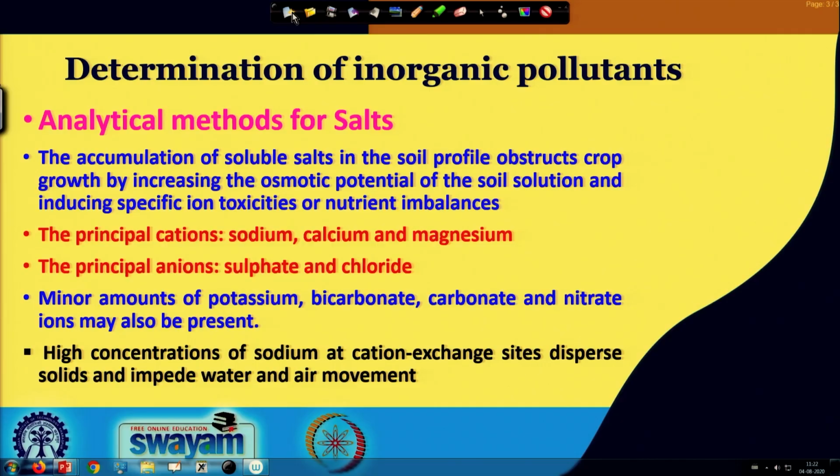So in today's lecture we will be talking about basically salts, then we will be talking about trace elements and other elements, total elemental analysis, and then we will be moving towards the organic pollutants. So, let us start today with the analytical methods for salts in the soil.